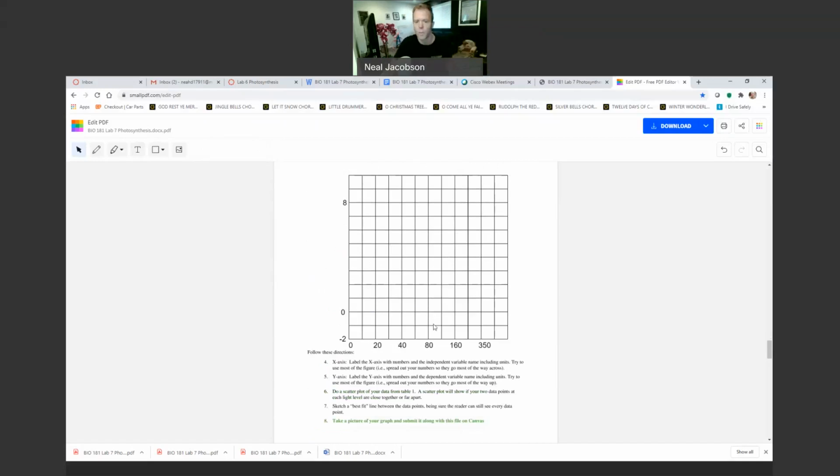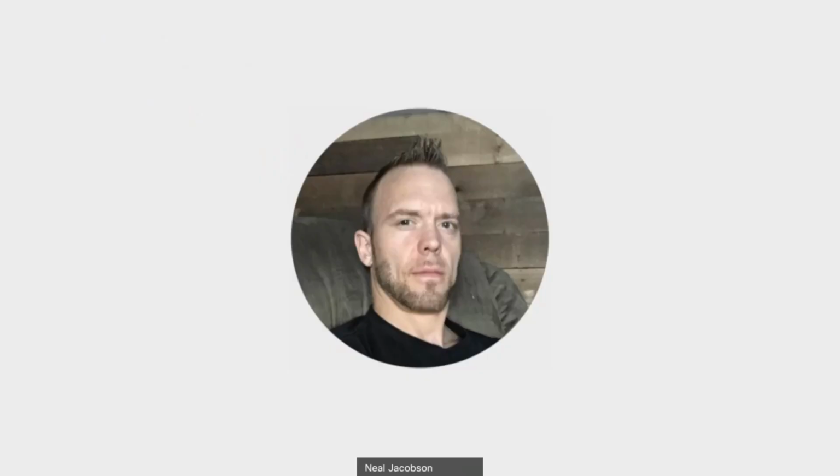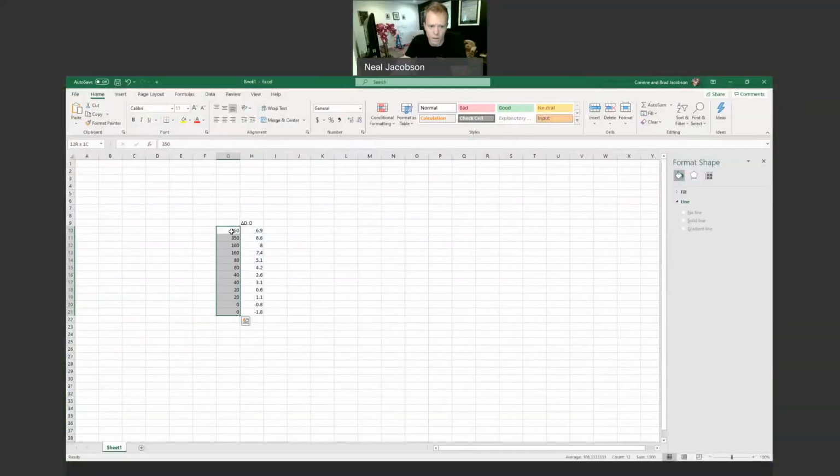So I'm just going to pause it. I'm going to open up my Excel. What I'm going to show you is I'm going to copy this data over, and I'm going to correlate it in a column next to these x-axis variables. And I'll show you here in a second. So I'm going to pause the video, and when I come back online, I will have copied this over into Excel. All right, let me change what I'm sharing. Okay, let me share my Excel spreadsheet with you. Okay, so all I've done is copy over the one column that has my independent variable, my different intensities of light.